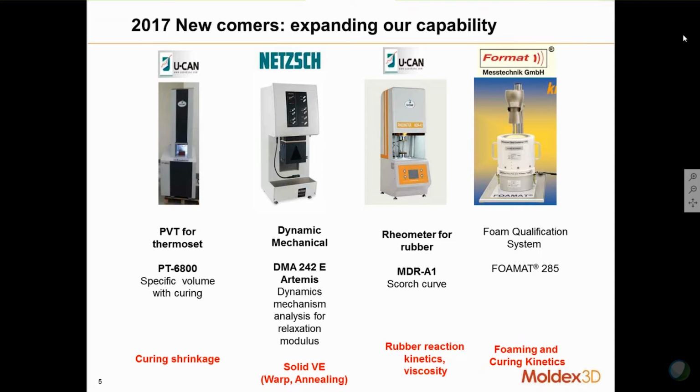And also we acquired a new instrument. This is specifically for rubber. It will give you a scorch curve, and it will tell you the foam pressure as well as the torque.